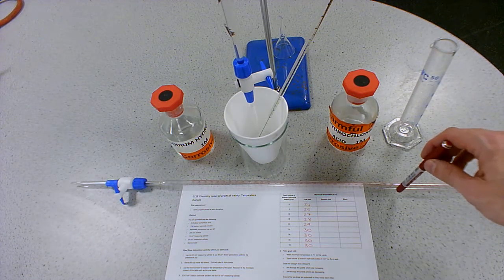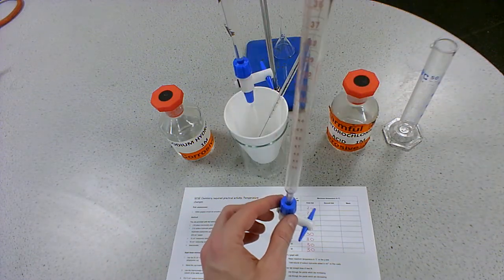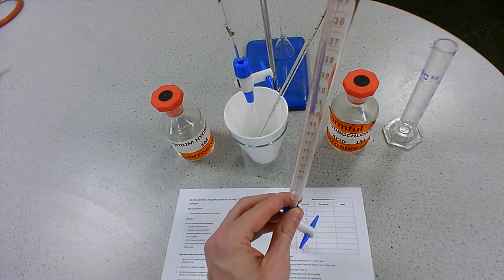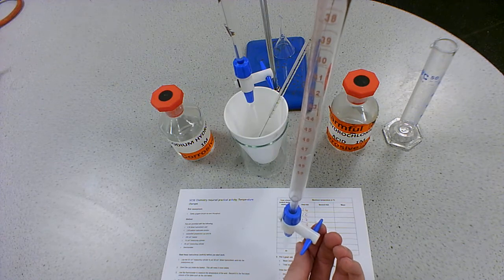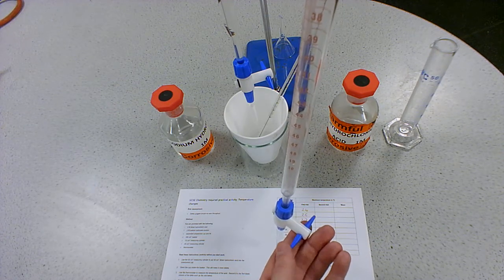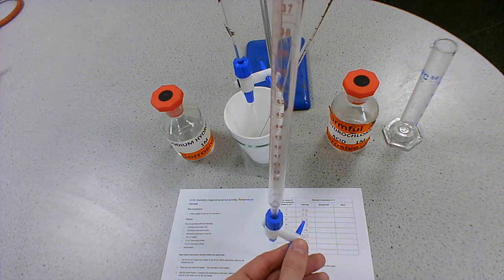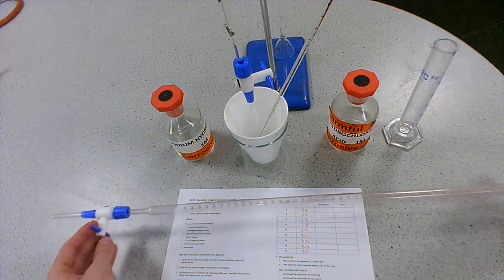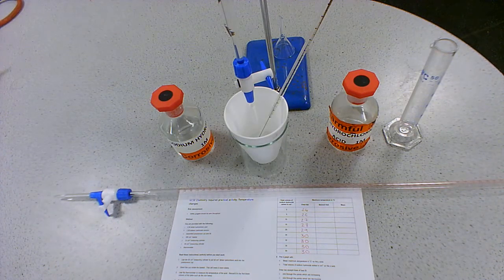Whereas if we use a burette, what you can do is you can fill the burette with your sodium hydroxide all the way to the top. And then when you want to add it, you just open the tap, let 5 centimeters cubed go through, close the tap. And then when you want to add your next 5, you open the tap again, let 5 centimeters cubed through, and then close the tap. And it just makes it significantly quicker and easier, and actually a more accurate way of adding variable volumes of something.